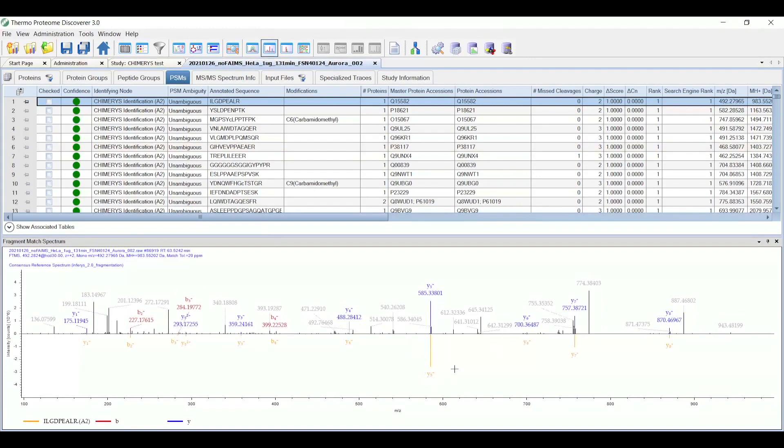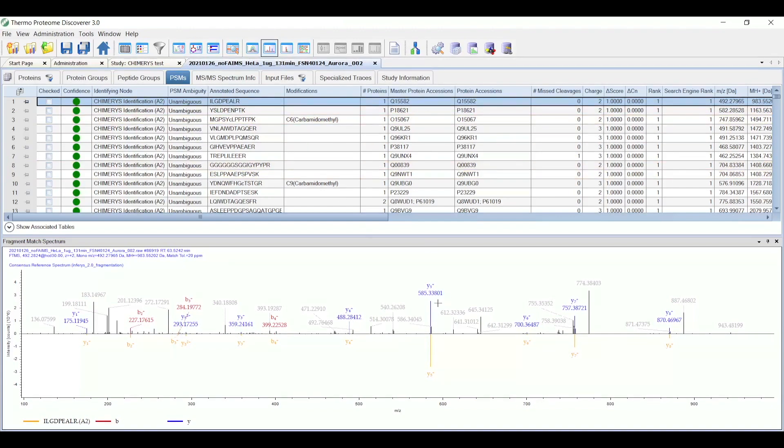And down below, which is a new feature, also in Protein Discover 3.0, is the predicted spectrum for that sequence, using the Inferis algorithm. So as you can see, for the fragments that were matched for this peptide, the abundances match quite closely in the experimental and the predicted spectrum.